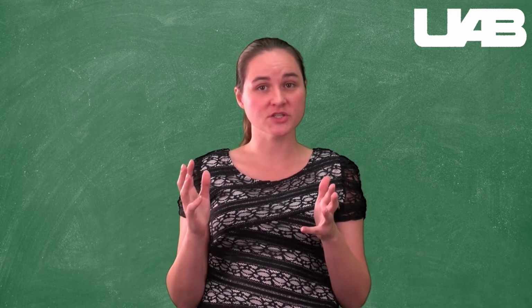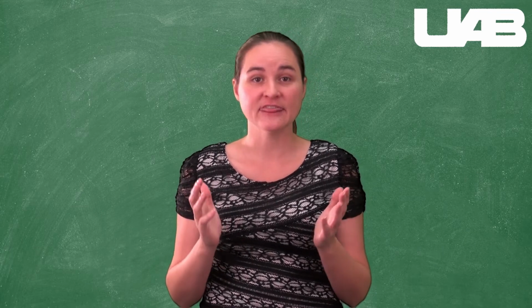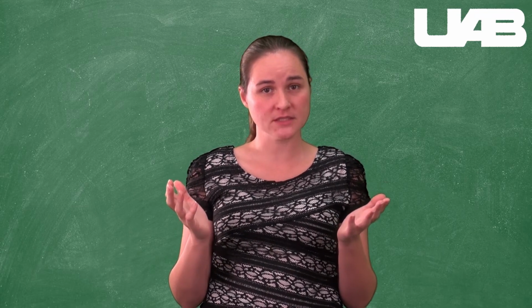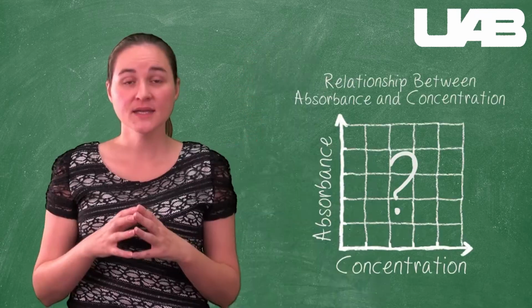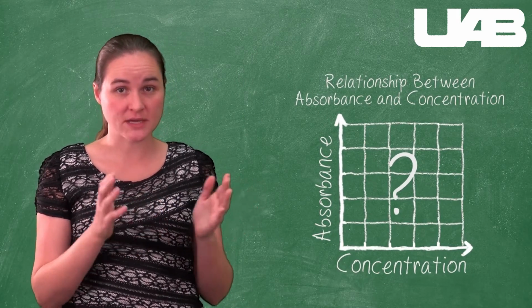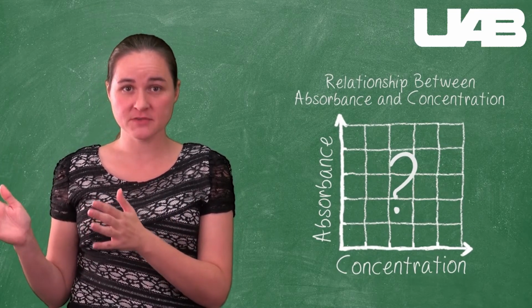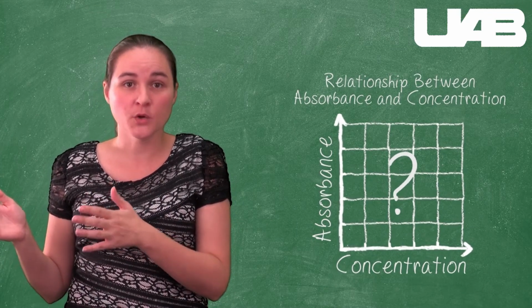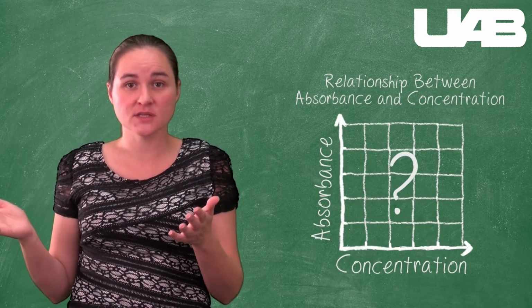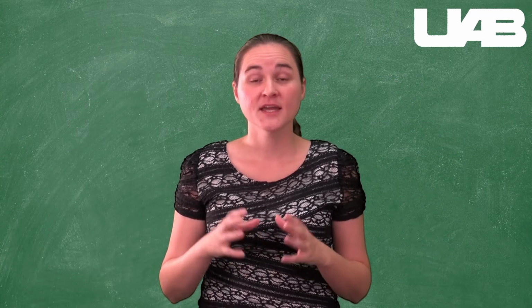If you were given a sugar solution with an unknown concentration, you could measure the density, then use the relationship that you determined to find the concentration. The same principles apply here. You made your dilutions, you measured a physical property of your dilutions, and now you will need to graph them to find the relationship between them, whether it is linear, inverse, logarithmic, or even if there is a relationship at all.